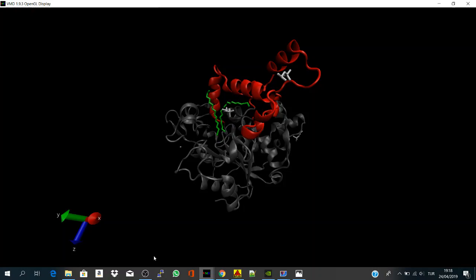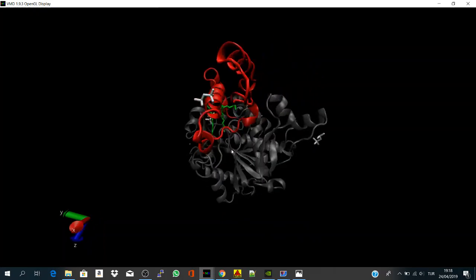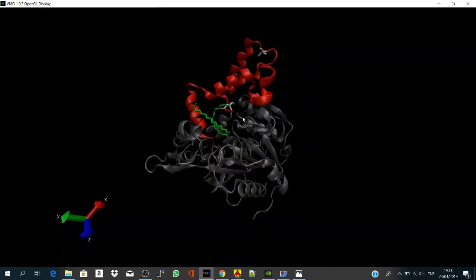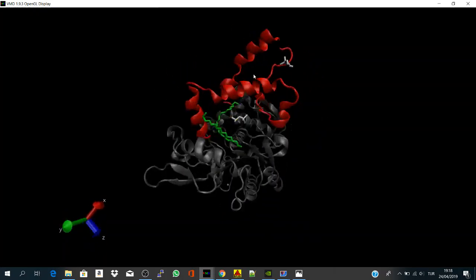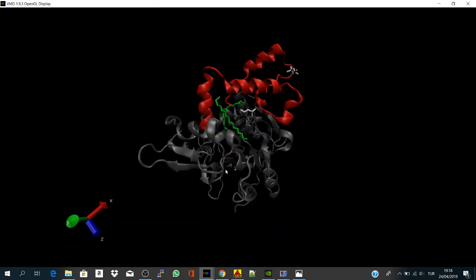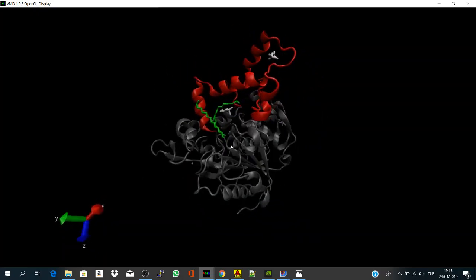So I will continue using the same structure we used before, which is btl2 lipase, and I will try to get a nice figure from this representation.